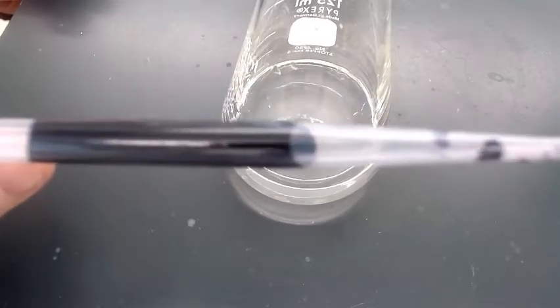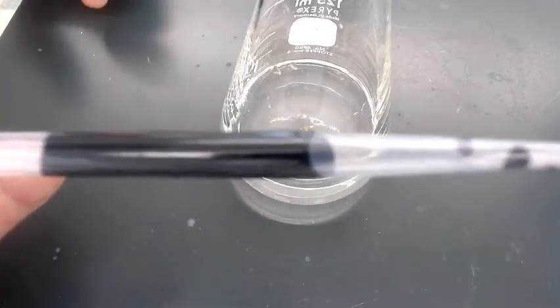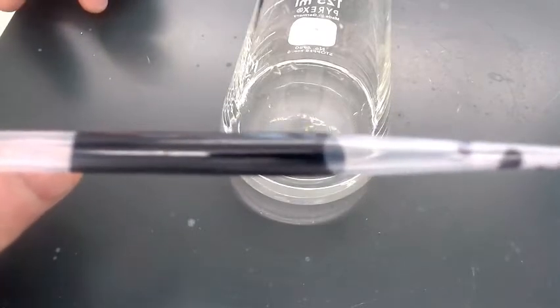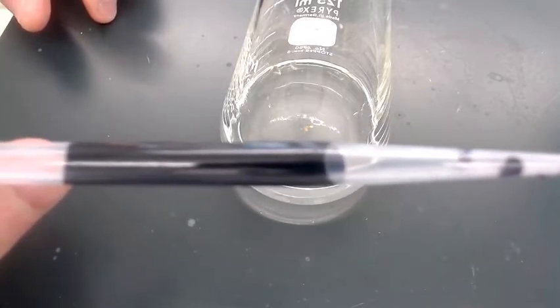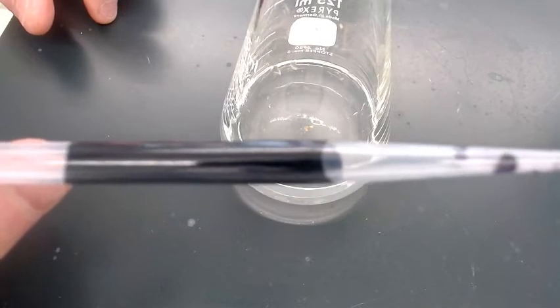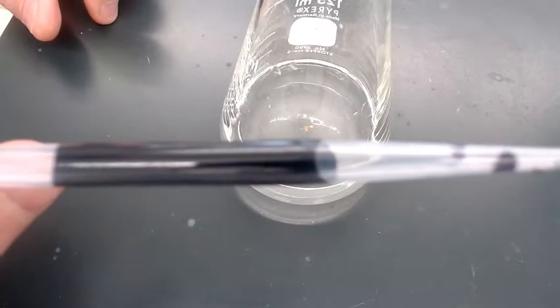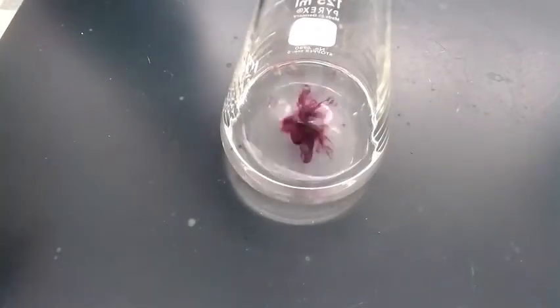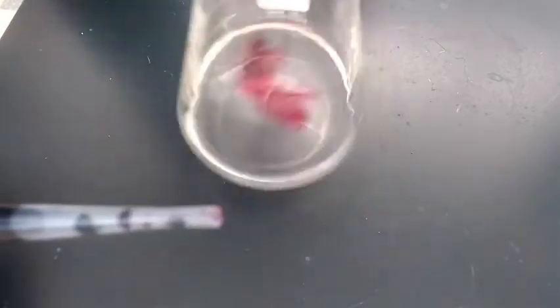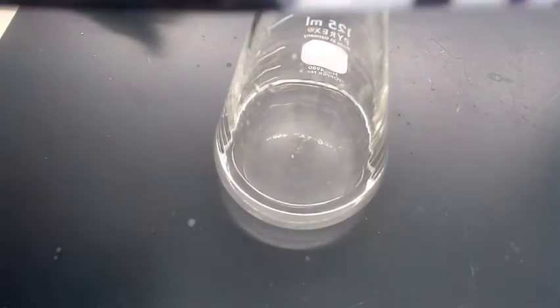That permanganate has a certain oxidation number to it. We'll do the calculation in a little bit. We know the oxygen has an oxidation number, and we know the potassium has an oxidation number. But if these change, this solution is no longer going to be purple. If something changes, and in this case it's going to be the manganese, if it changes from the oxidation number that it currently is to something else, it's no longer going to be purple. Well, that's what's happening right here. The manganese is no longer at an oxidation number that creates a purple solution.